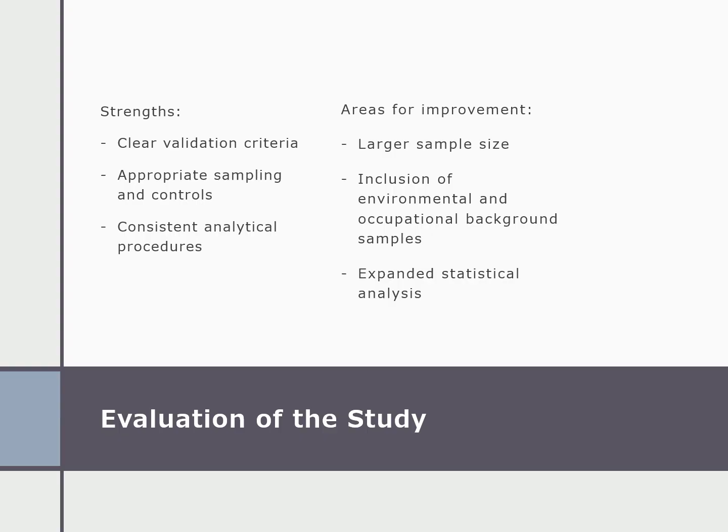However, there are also areas for improvement. Increasing both the number and diversity of samples, such as those from different environmental or occupational sources, could help demonstrate how well SEM-EDX performs across more complex case scenarios. Additionally, expanded statistical analysis would further strengthen accuracy estimates and enhance interpretation confidence.